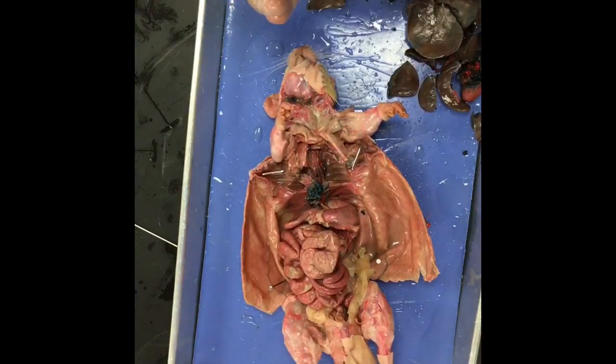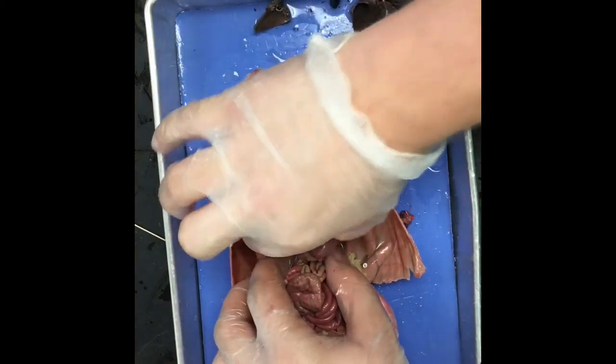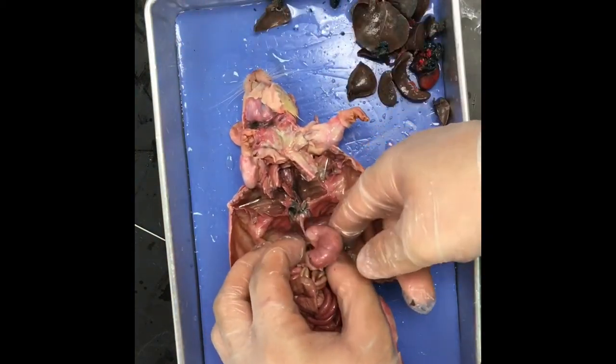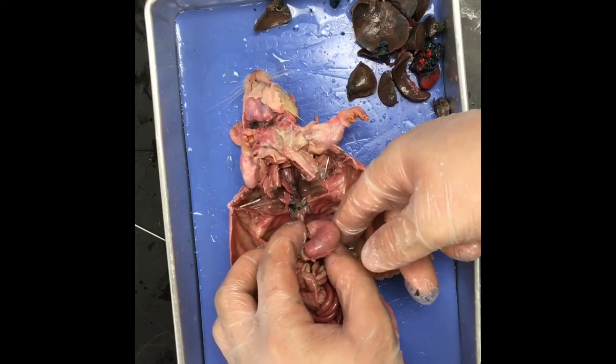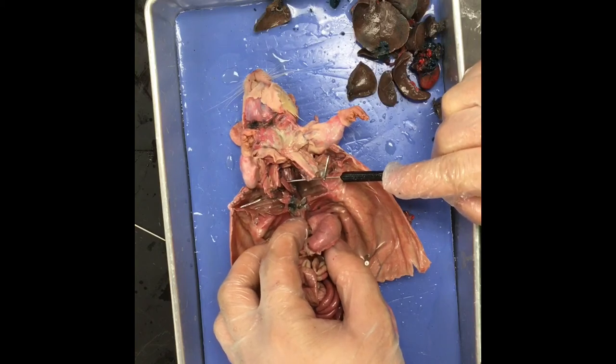Alright, can y'all see okay? Is that the stomach? You're gonna see. This is the stomach here. That's when I pull on this, do you see that top part that's moving? I'll put a probe on it. This part right here.